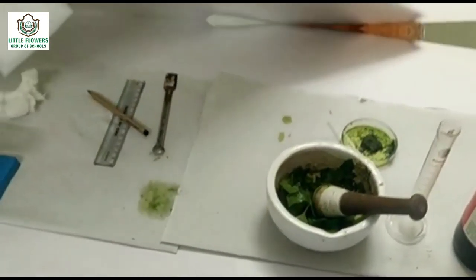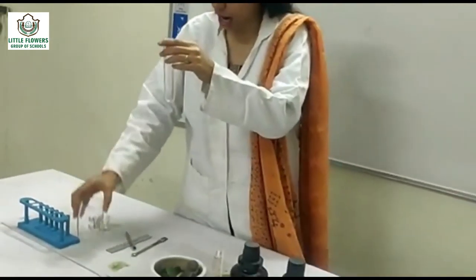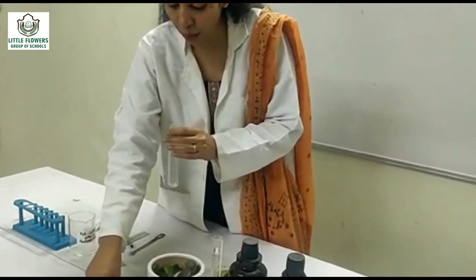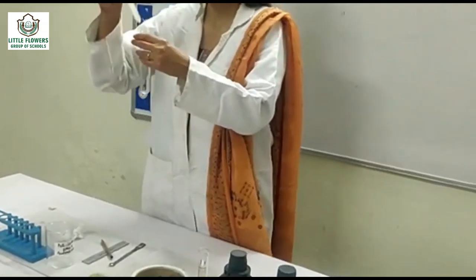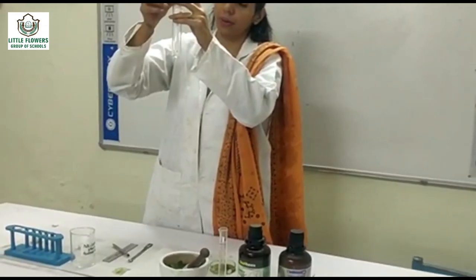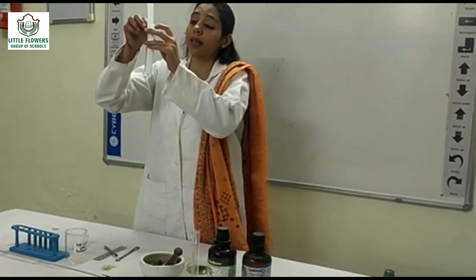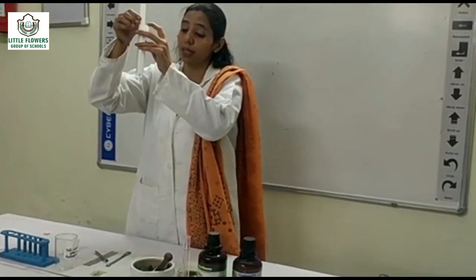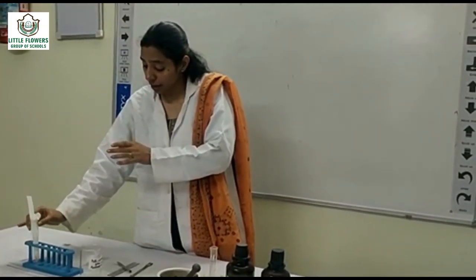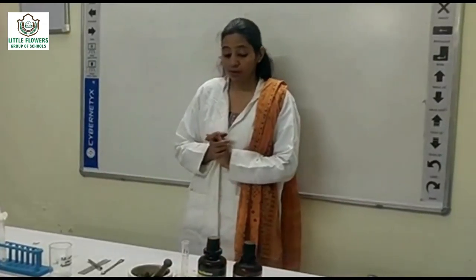Take some petroleum ether and acetone mixture in a boiling tube. Now pack the strip in the boiling tube 1 cm above the solution. Now plug with cotton so that the solution does not evaporate. Leave the solution undisturbed for some time.